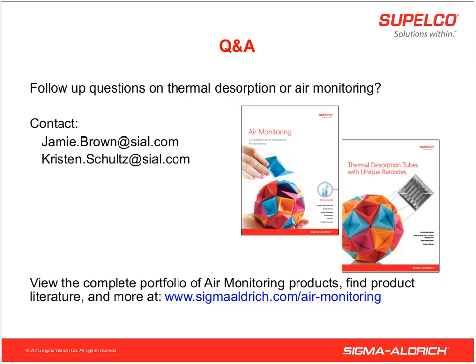So we always try to match it to the tube, but depending on what you're sampling for, if you're not interested in sampling compounds below benzene, you could eliminate or not include a carbon molecular sieve, and that would completely do away with any water problems during desorption, because that refocusing trap won't trap any of the water. So hopefully that's somewhat helpful.